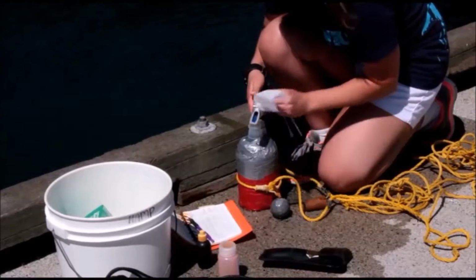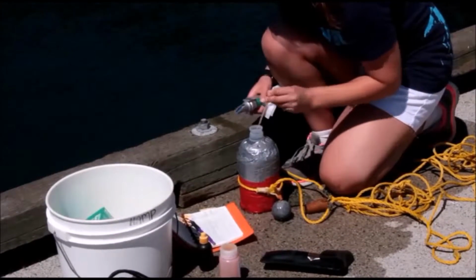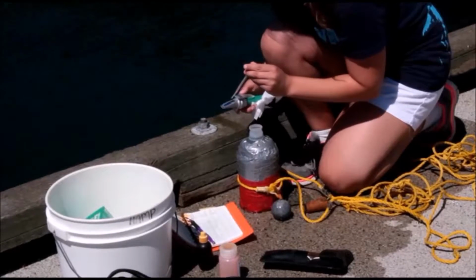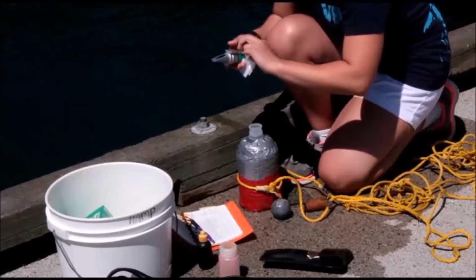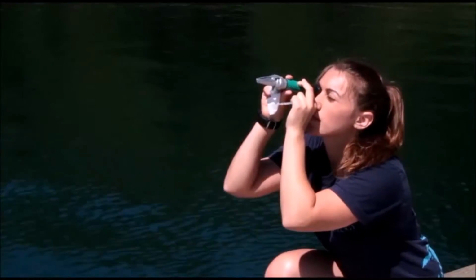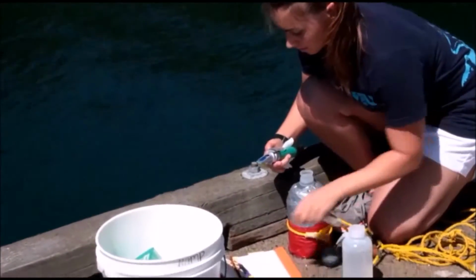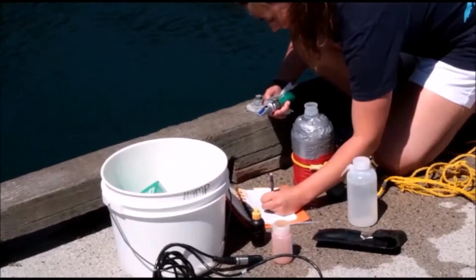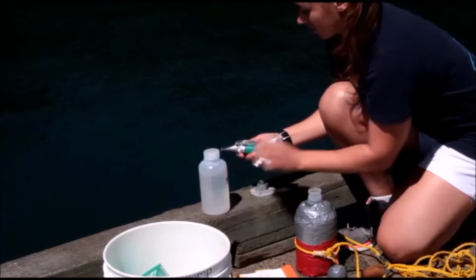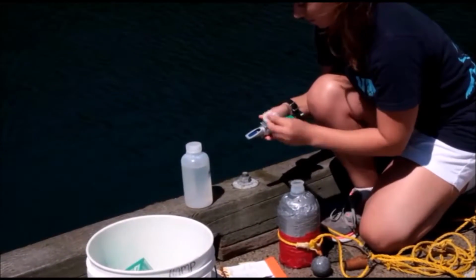Some multimeters measure salinity, others don't. If you don't have a salinity measuring one, what Jeanine has there is a refractometer which measures salinity. You just take a little bit of your sample, the pipette, put it on the surface, cover with the little lid, look into the light, and you'll see the measurement of the salinity in the viewfinder. Note that down, and then clean off the refractometer with fresh water and dry it off with a Kim wipe before putting it away. That way it doesn't rust or corrode.